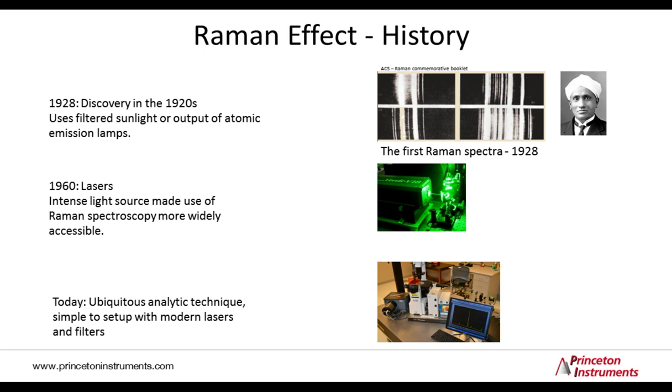As we will see, Raman scattering is a weak effect, and using the light sources available back in the day, you could only record a spectrum like is shown here by exposing for a couple of hours.